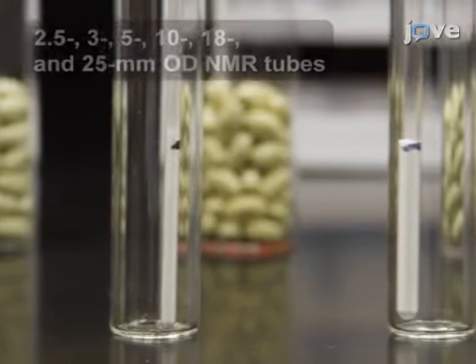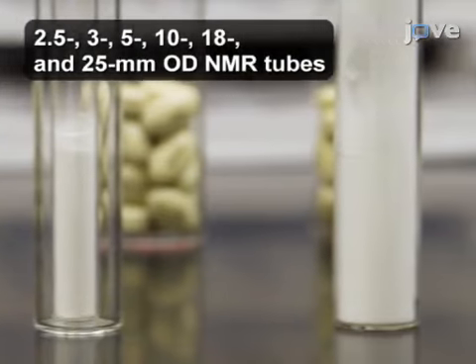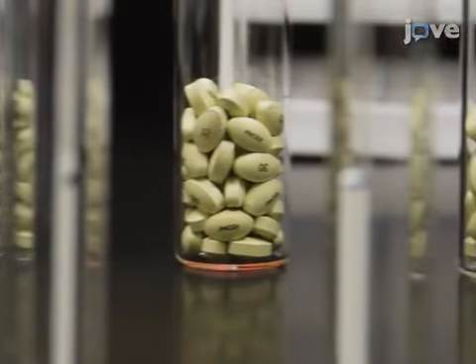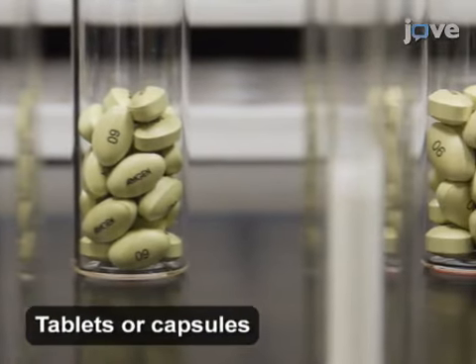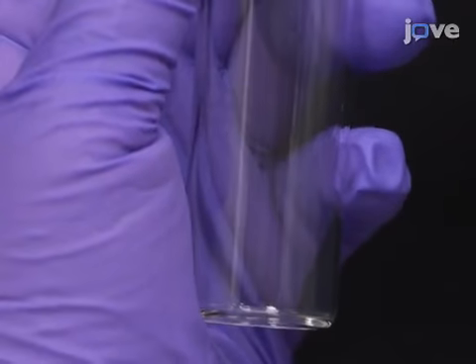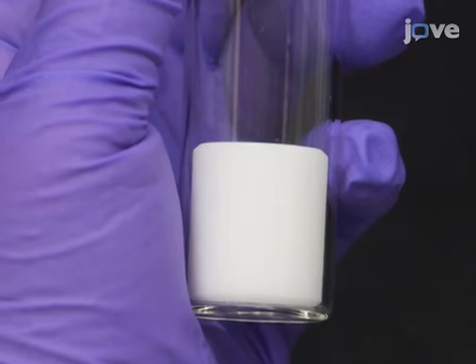Weigh the samples for calibration in the appropriate NMR tubes until the marking line, or around 30 mm in height. Also weigh the formulated drug product samples in the appropriate NMR tubes until the marking line, or around 30 mm in height. Next, place the Teflon standard sample inside a 25 or 26 mm NMR tube.